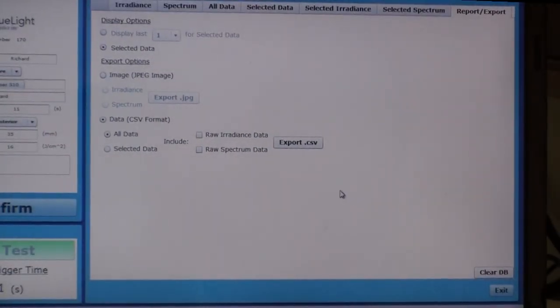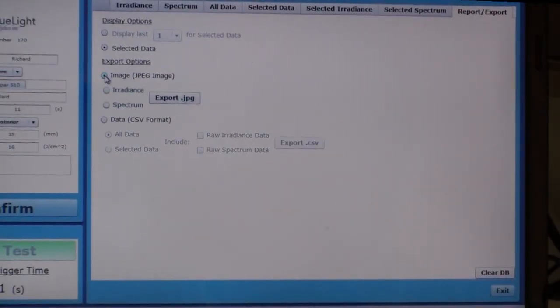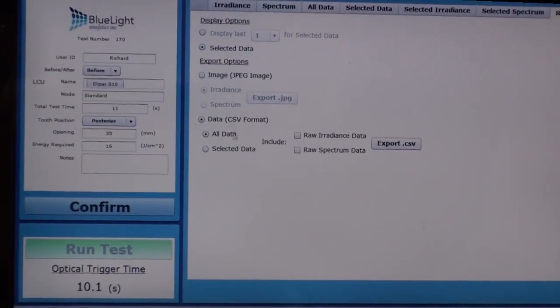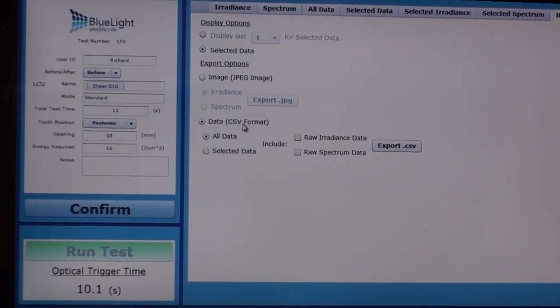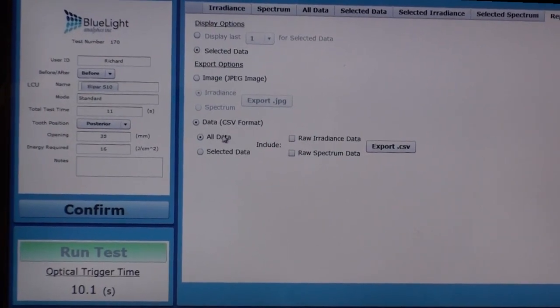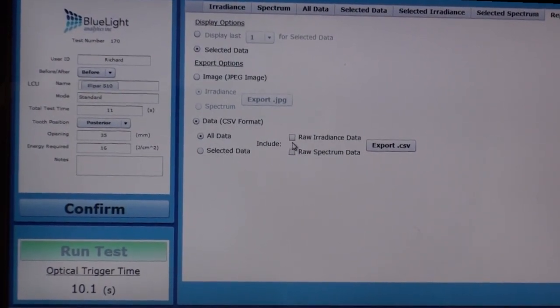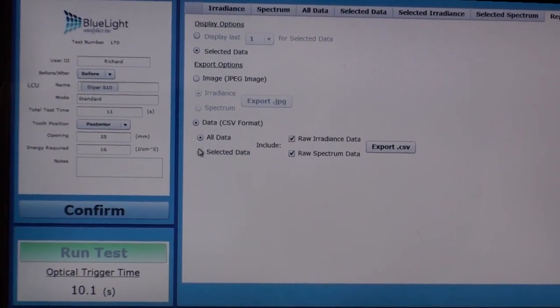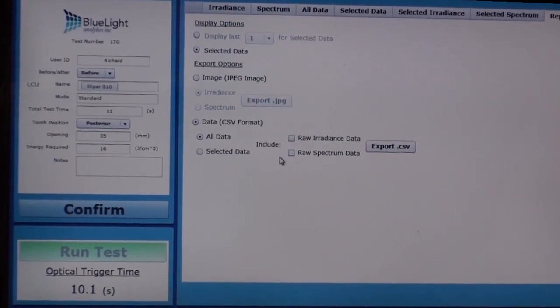We can export the data. Looking at the options, we can export just an image, or we can export the irradiance or the spectrum as a JPEG, and also we can export the data as a comma separated value format. We can export all the data. We can export the raw irradiance data, the raw spectrum data, or we could just choose to export selected data as a CSV file.